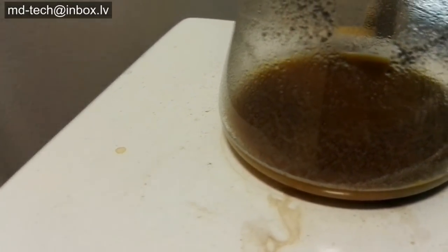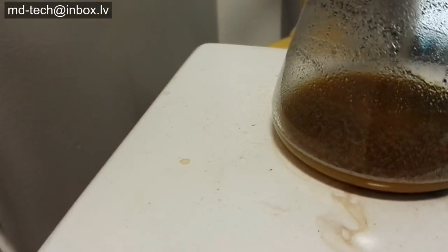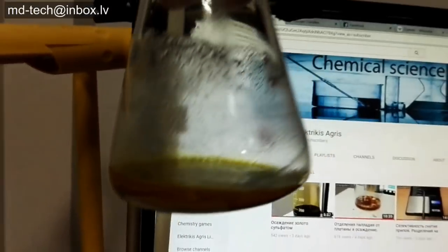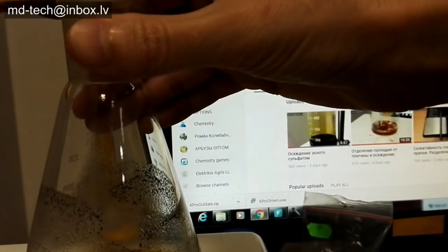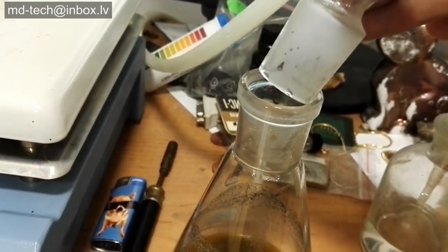This brown color is good. Let it cool down and test with stannous chloride solution. I use dry tin chloride crystals — it's stable over a long period of use.